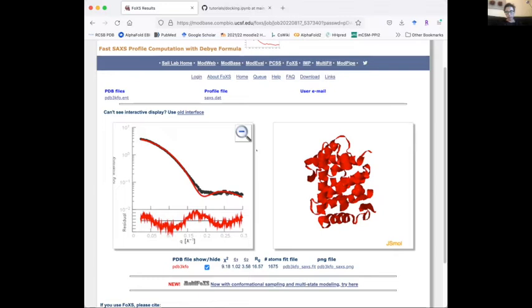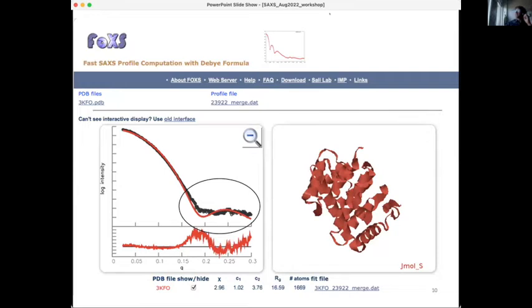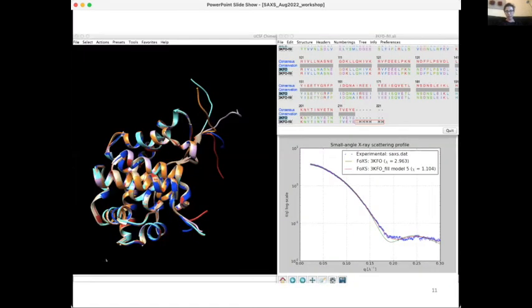So how can you add the HISTAG? Anyone has ideas? Using AlphaFold? Yes, that's probably the default today. Because it's so automatized, you can really grab it. Yes, it's so easy to use AlphaFold to add the HISTAG. But there are many other options. So I like using Modeler for this purpose. So whatever you like.